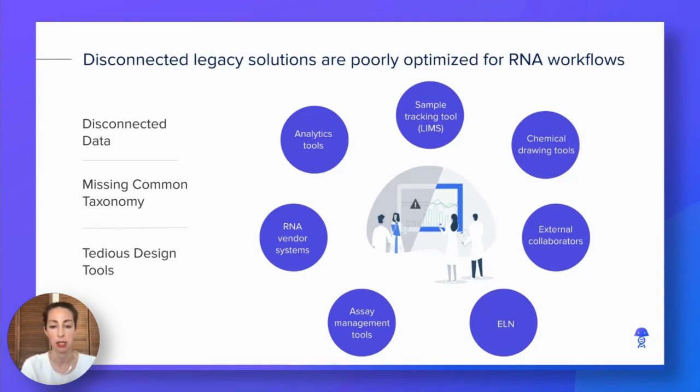Given that there's also significant partnership opportunities for many RNA therapeutics companies, it is also important to highlight that data sets with academic, industry, and CRO partners will be siloed and extremely difficult to control shared access to and connect with when the time comes.